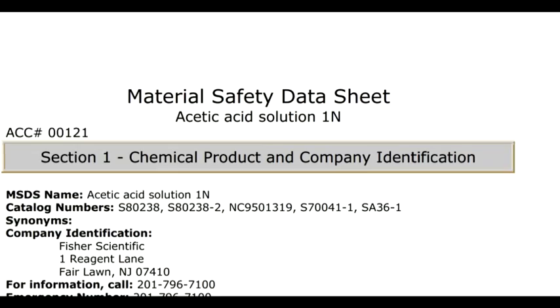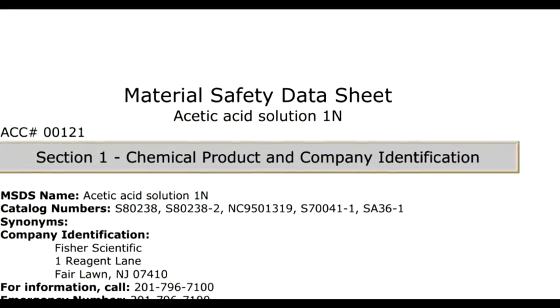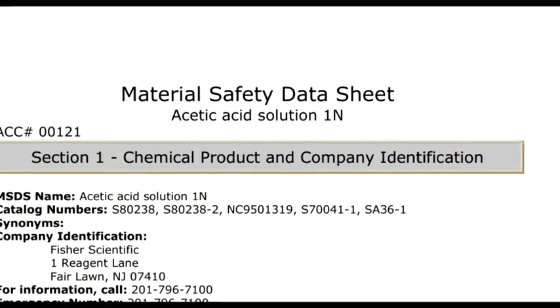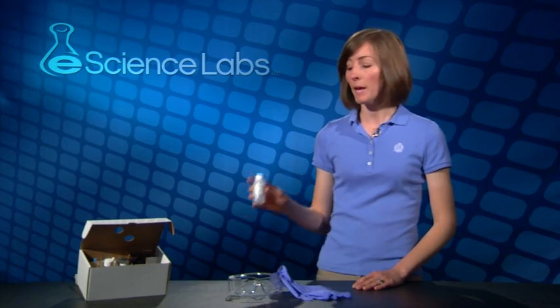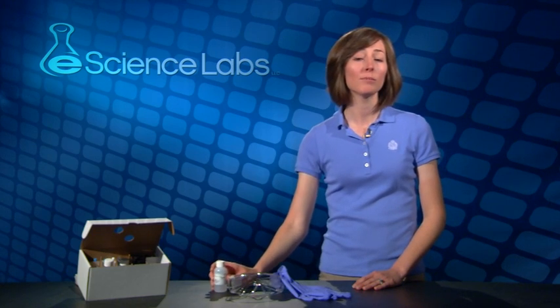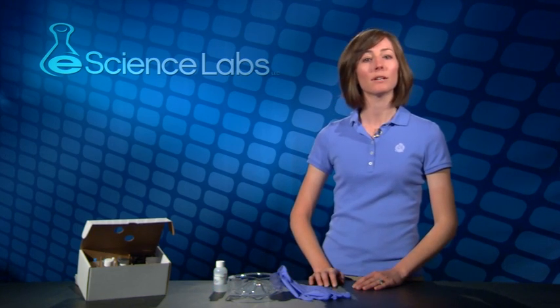These sheets, also known as MSDS, list the dangers, storage requirements, exposure treatment, and disposal instructions for every chemical. The MSDS for any chemical supplied by eScience Labs can be found on our website.